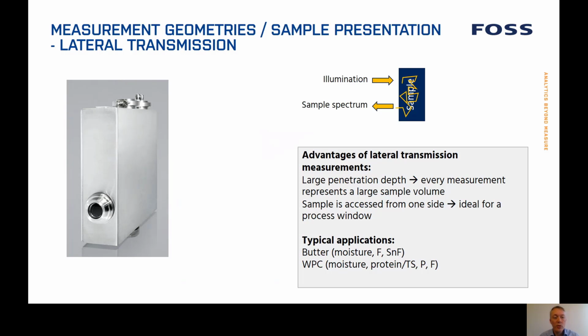One thing to pay attention to is that lateral transmission requires a certain level of light scattering in the sample, so it will not work for clear, transparent samples without light scattering.